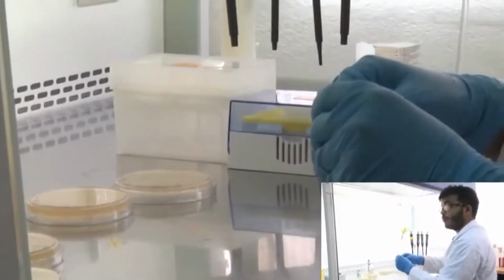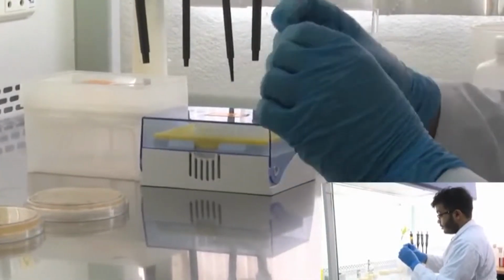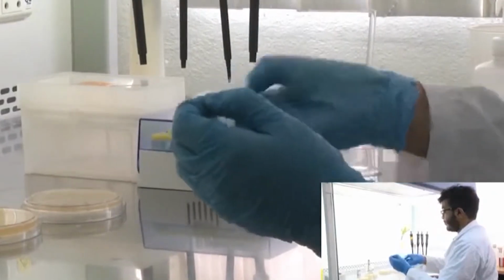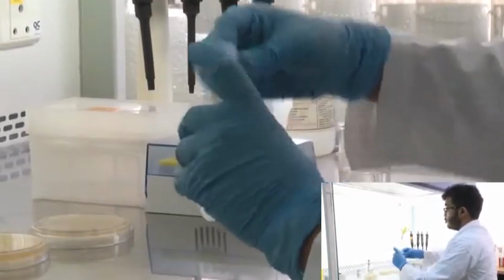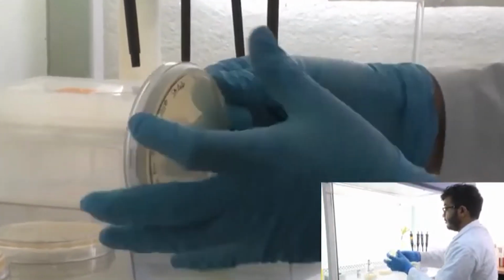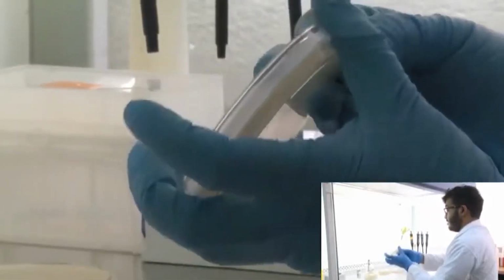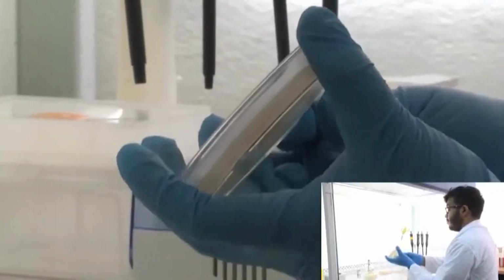2 of them I am going to store for subsequent use in the future. So I am taking parafilm. It's basically a type of sealant. These 2 plates I am going to store. We take the parafilm and it's very stretchable. As we keep stretching, it creates an airtight seal, and in this manner, once the entire petri dish has been sealed so that it doesn't suddenly open up, we are going to store it at 4 degrees centigrade.